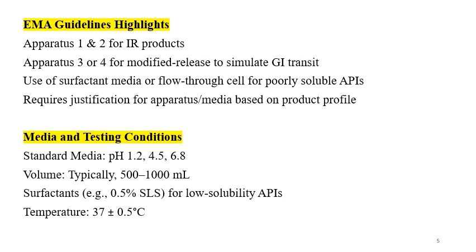Use of surfactant media or flow through cell apparatus can be used for formulations containing low soluble or poorly soluble APIs and for some of the soft gelatin type of formulations. It requires justification for apparatus and media based on the product profile.